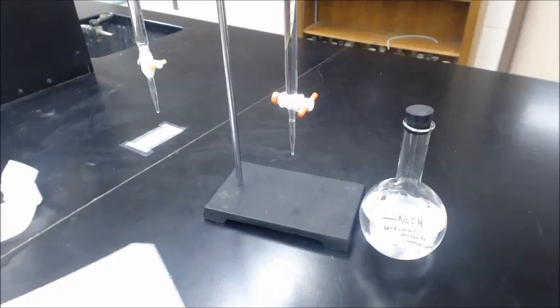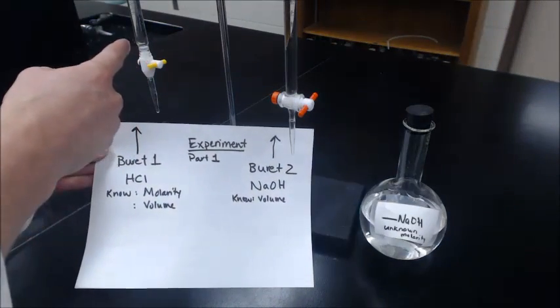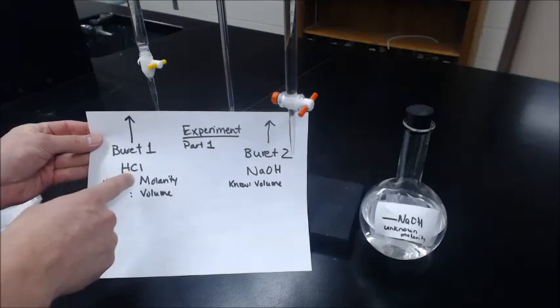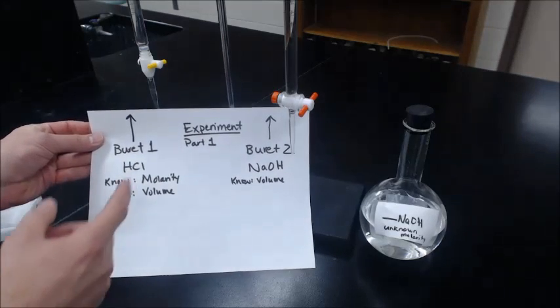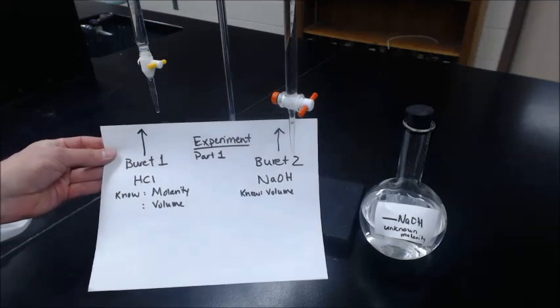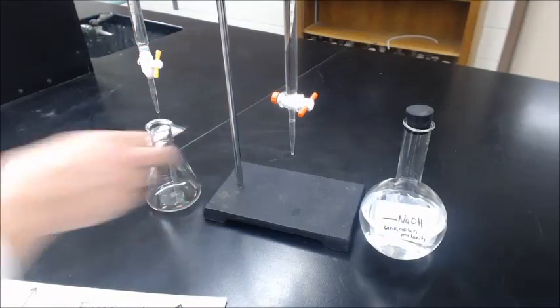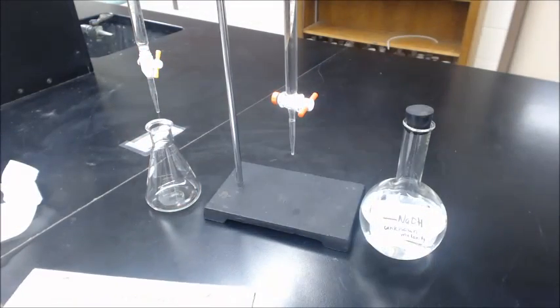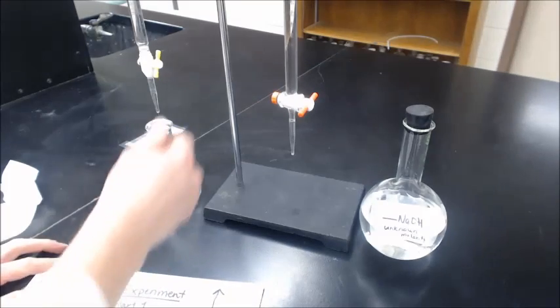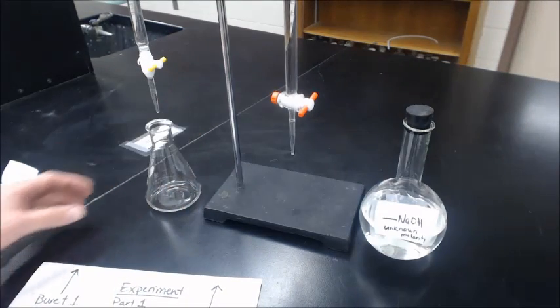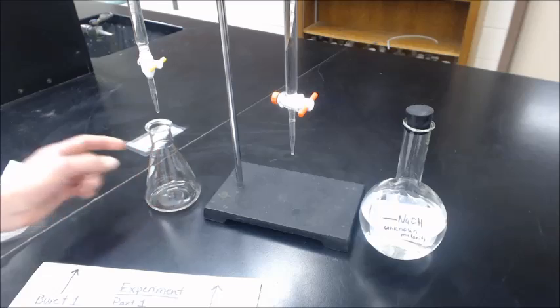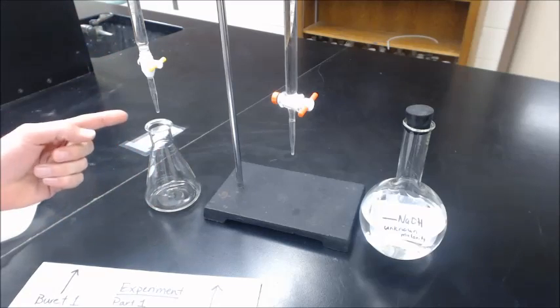In this other burette, you're going to have hydrochloric acid. You're going to know the concentration, the molarity, and you're going to dispense out a known amount of it into another Erlenmeyer flask. Somewhere around 25 milliliters, but measure the volume precisely. So you're going to know the volume and the molarity.